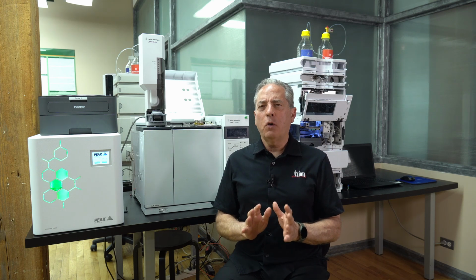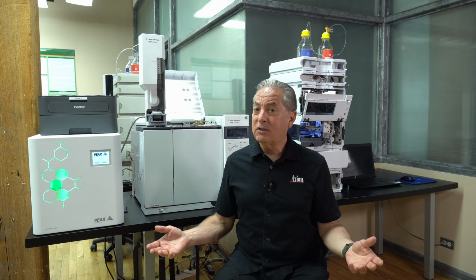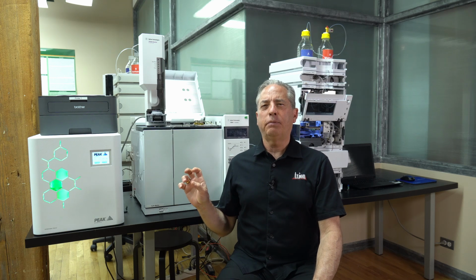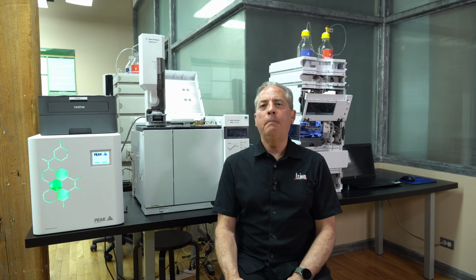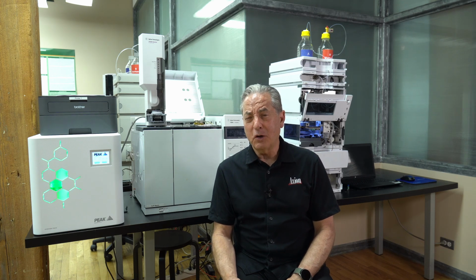So although the chances of that happening are very small, there's a million GCs in the world, we don't hear about GCs blowing up all the time, so clearly they make these tanks really strong, but to me, that is the place that I focus on in safety, because you want to make sure they're chained up, they're kept properly. Talk about a falling hazard, or you drop one of those on your foot, you break a foot.